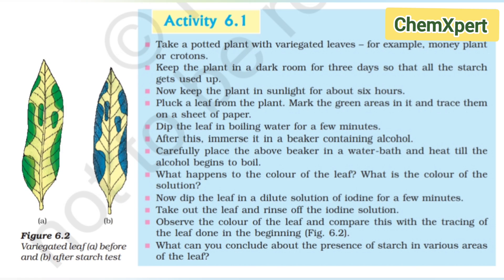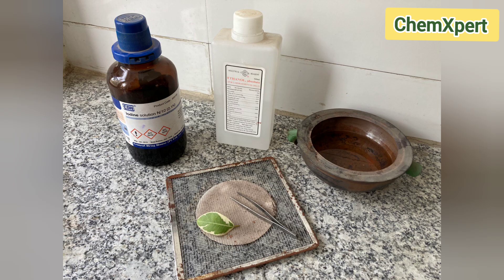In this video we will perform activity 6.1 from Class 10 Science, chapter Life Processes. For this activity we require an iodine solution, ethanol, a water bath, and a variegated leaf.